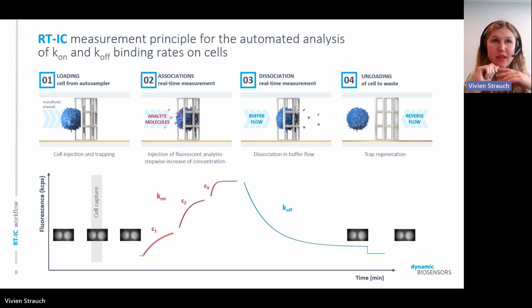However, there are especially two major drawbacks, I would say. The first drawback is that this is often not stable enough. So if you want to apply higher flow rates, your cells are very likely to get lost. Whereas since we have these cages, the cells are much more stably immobilized and you do not depend on any attachment through surface molecules to the chip surface.